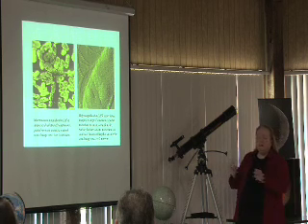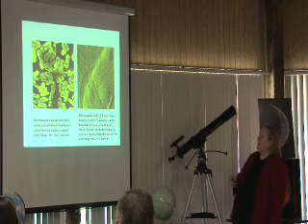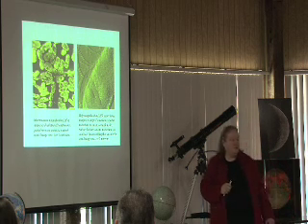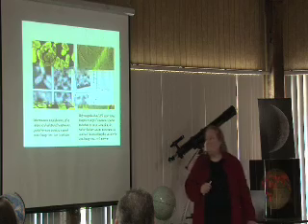Pseudomonas putida. If you were Latin, you'd probably pronounce that correctly. But you can look and see the very fine detail of what the surface of a bacteria looks like. And this is very interesting to biologists with AFM.